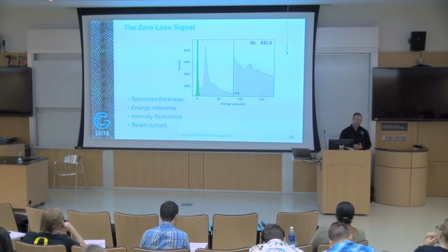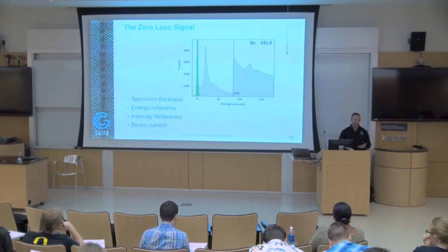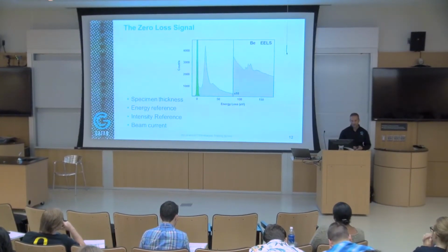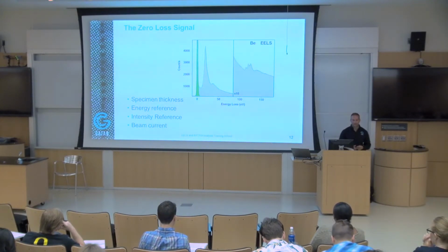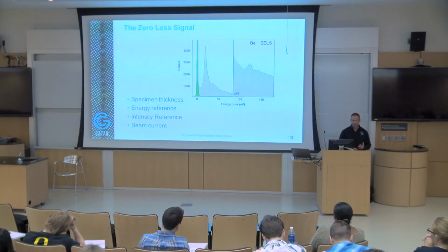So when you do quantification, you might have a passivated layer with oxygen, but you're still assuming that the oxygen is bonded to the silicon, but it might not be the case. So it's always better to just look at the shape, because from the shape you get chemical information. With quantification, you don't know how these elements are interacting with each other. A lot of times, especially when you look at oxygen, you might have a passivated layer on the surface, and that could cause changes.